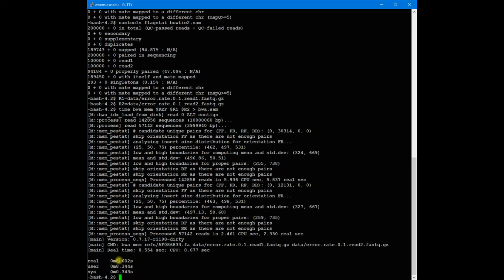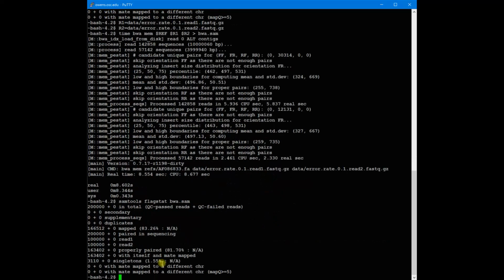Okay, this time BWA took 8 seconds to finish. And the alignment rate is 83%. Now let's do Bowtie 2 again.